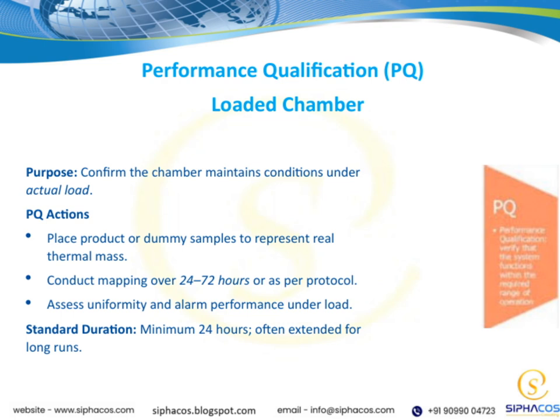During this process, we evaluate the uniformity of temperature and humidity throughout the chamber and check how well the alarm system responds under load conditions. This helps us identify any potential issues before actual production runs. Generally, the standard duration for PQ is at least 24 hours, but it can be extended for longer runs to ensure stability over time.